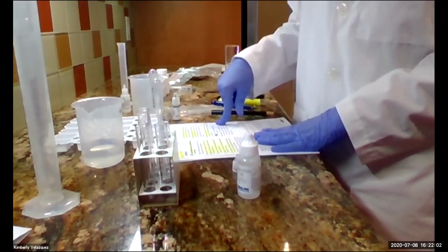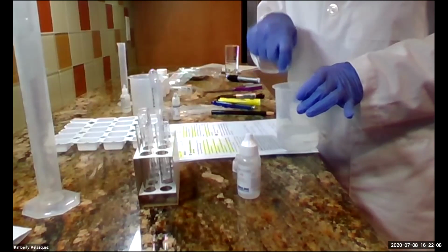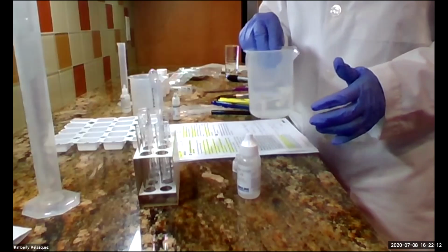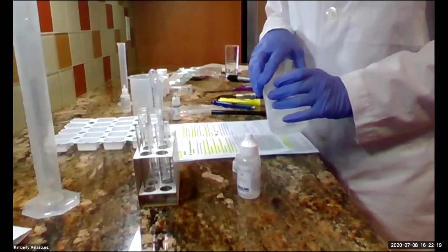Remember, there is an activity 3. In activity 3, you're going to just add water to the beaker, add pH indicator, mix, and take a starting picture of what it looks like before you blow the bubbles. Then you're going to use a straw and blow bubbles and note the final color.